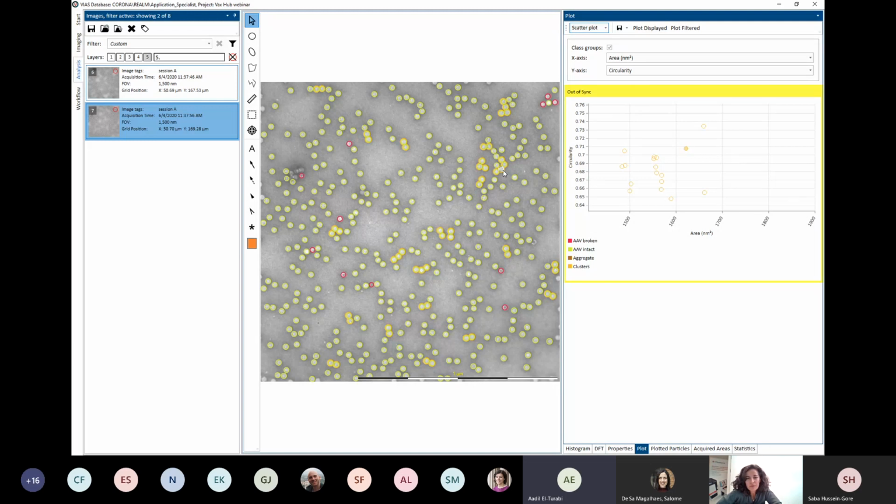One of the things I'm interested in is that we're making various constructs, different particles, virus-like particles, which may have quite pleomorphic representations. Ultimately what we would like to know is whether those things are functional. So we would do morphology, but then link that to some type of functional output, so immunological or antigenic. The question I had was based on the viral vectored work you've done, showing the difference in AAVs. How do you link that data and the analysis to the function of those viral vectors?